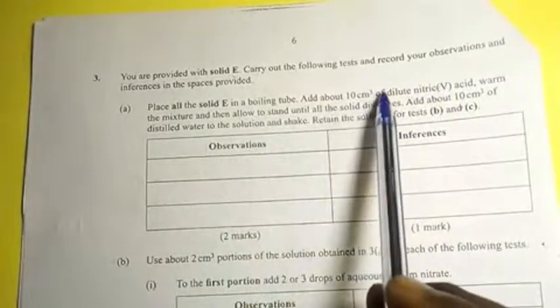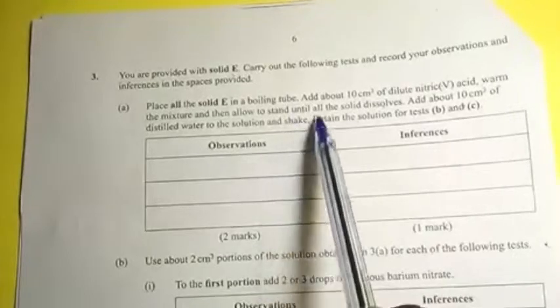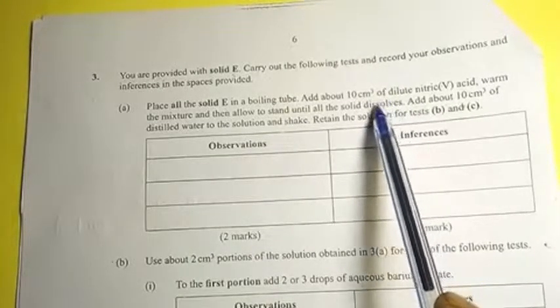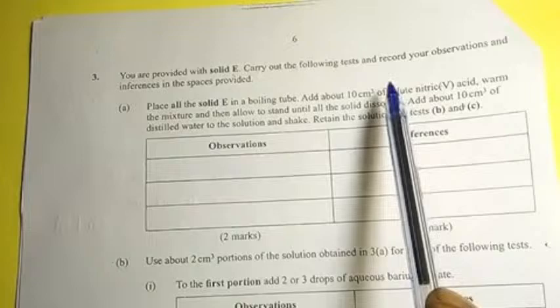So we are adding dilute nitric acid to salt E that you don't know. So we expect that the salt could be something like a carbonate. So we expect to see effervescence because we are adding an acid. That is the expectation, that you will see effervescence or you will not see effervescence. So whenever you are adding an acid to a given solid, just expect effervescence. If there is no effervescence, then it means there is no carbonate inside there or sulfite.